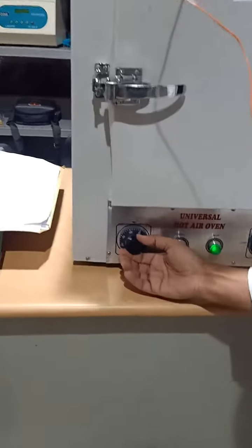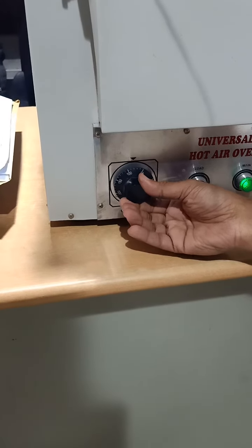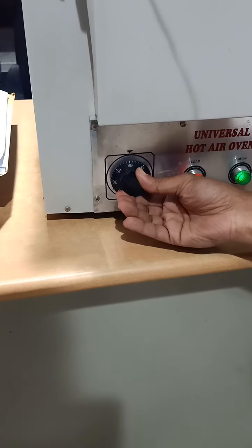Here is the dial, and using this dial I adjust the temperature that I need. For example, this setting is 50, and this one is 100, and so on.